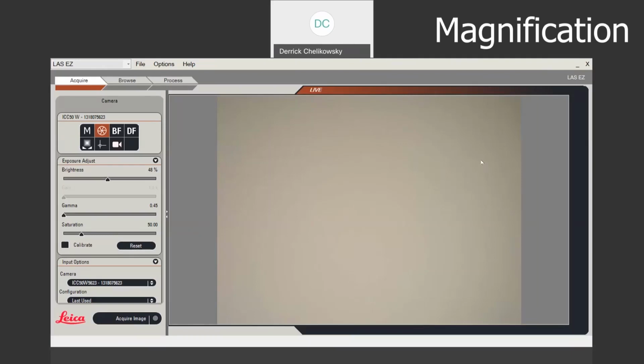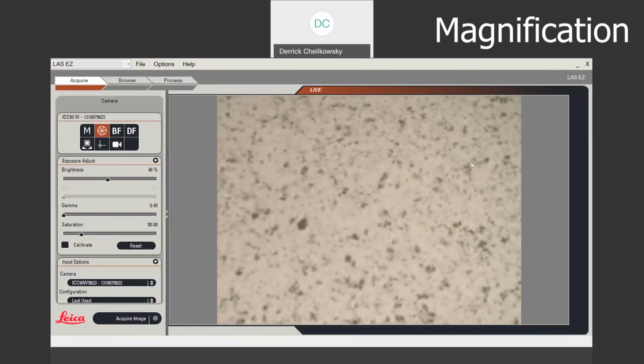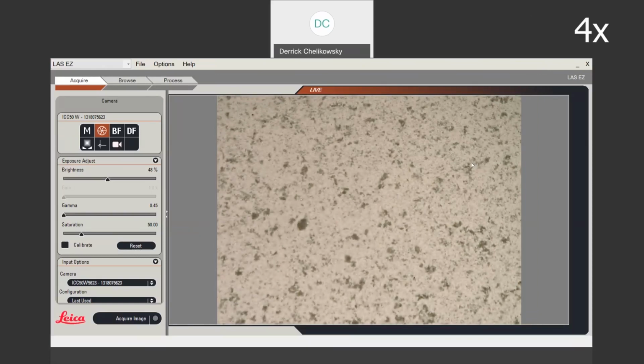Welcome everyone, this is our yeast wet mount video, and as you can see I am just starting to get the microscope up and running. Keep in mind that our magnification will be shown in the upper right hand corner of the video as we go. Now we are starting here on 4 times power, and I am raising the stage up and moving the fine focus to get us into a nice fine focus.